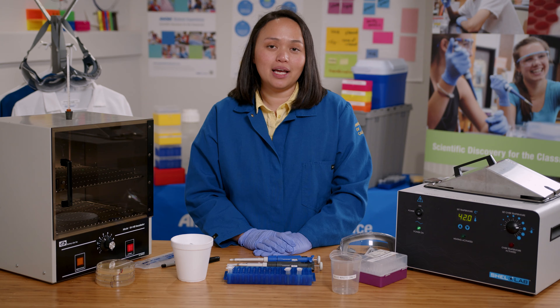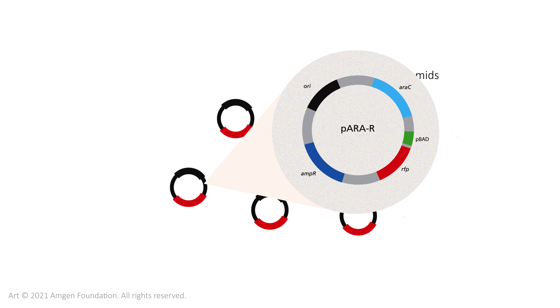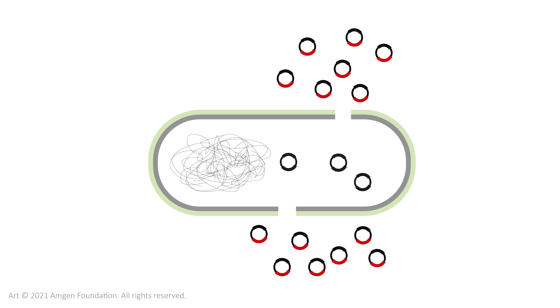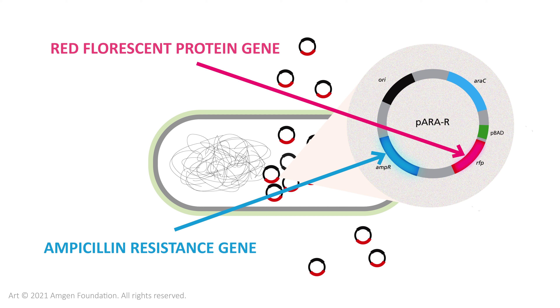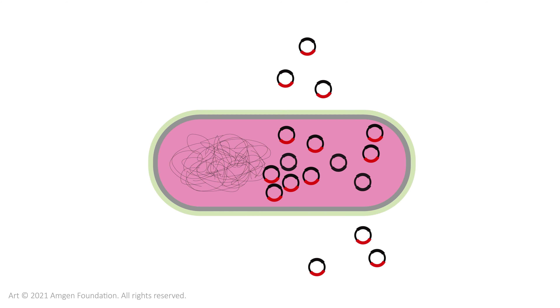I'm going to demonstrate lab 5a, where I will use a plasmid to transform E. coli bacteria. The plasmid has the RFP gene, the red fluorescent protein gene, and the ampicillin resistance gene. It can grow on a plate with ampicillin and express the red fluorescent protein.